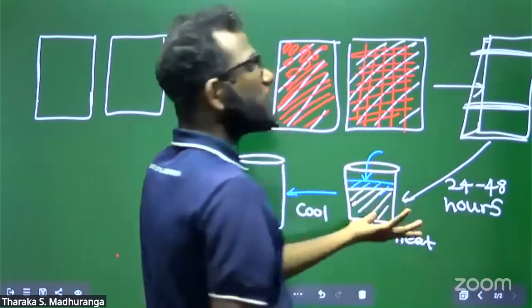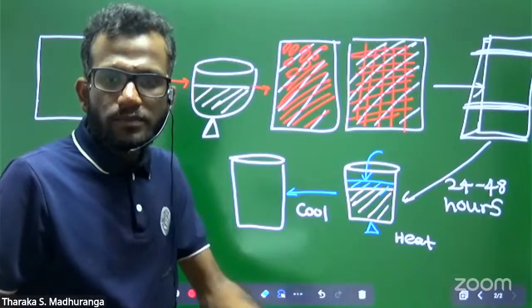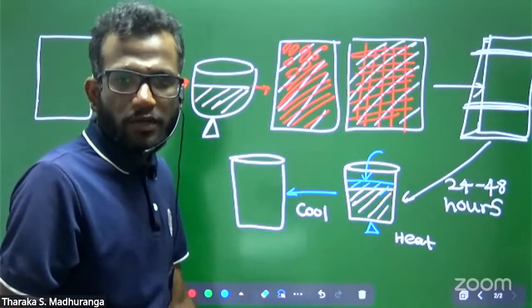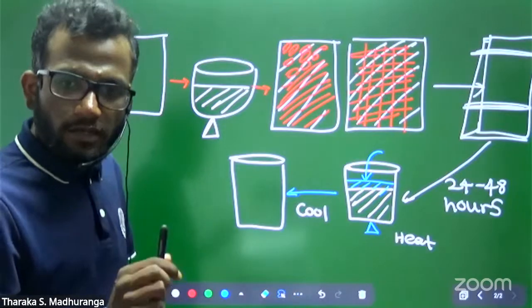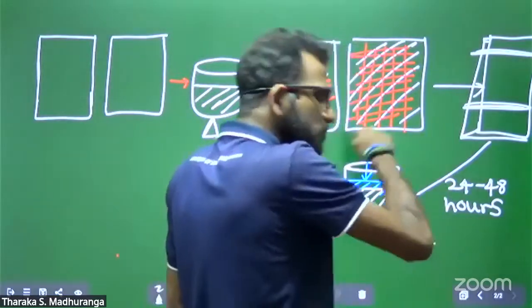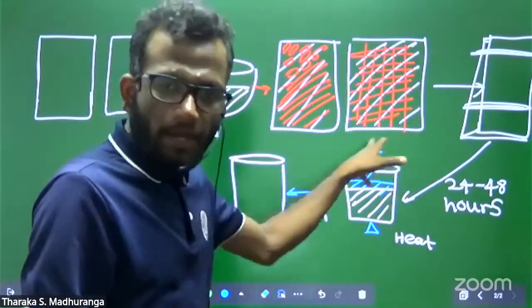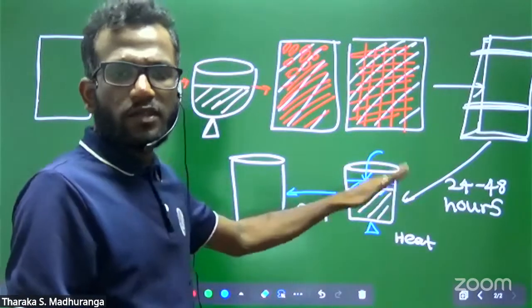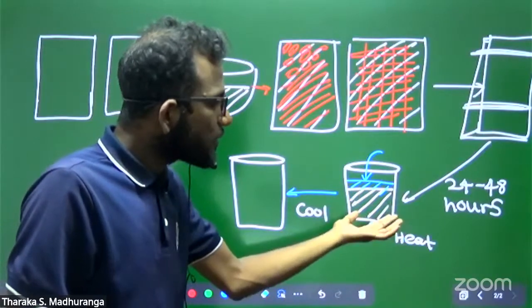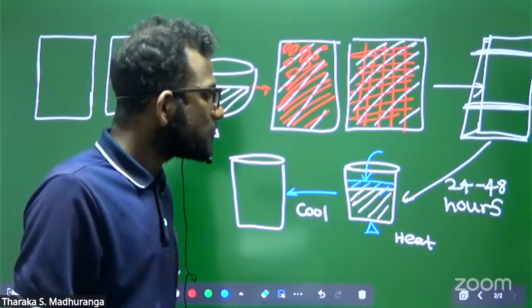After heating all this solution, watch this video. We discussed the practicals as well. We need to add ethanol carefully and heat the entire solution until the wax is melted.